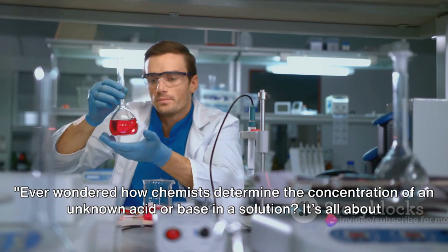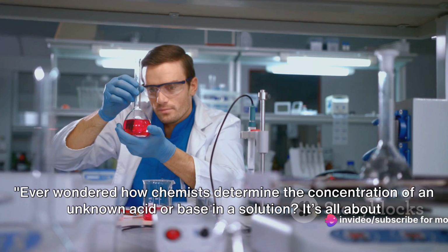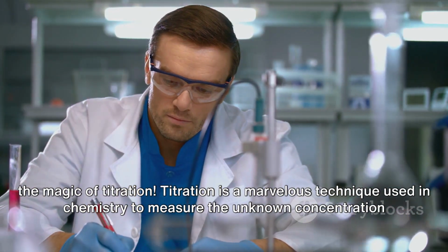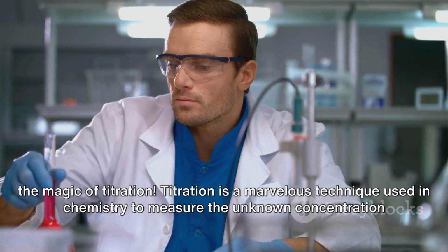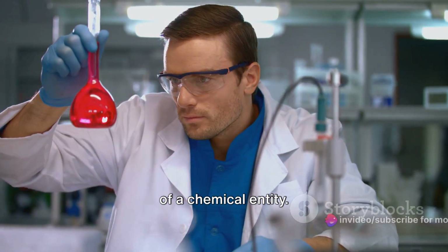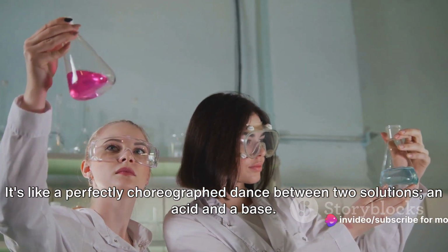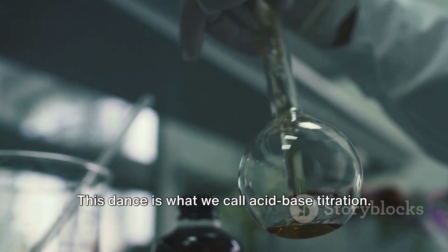Ever wondered how chemists determine the concentration of an unknown acid or base in a solution? It's all about the magic of titration. Titration is a marvelous technique used in chemistry to measure the unknown concentration of a chemical entity. It's like a perfectly choreographed dance between two solutions, an acid and a base. This dance is what we call acid-base titration.